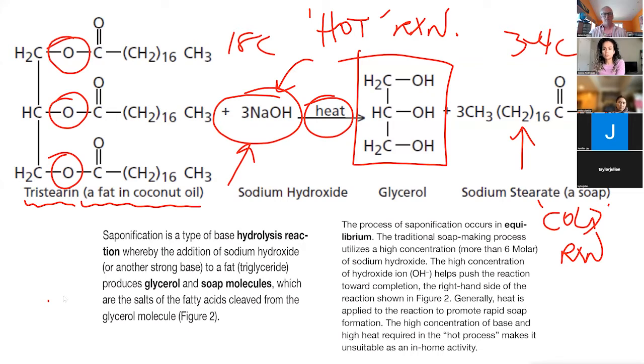There's a higher reaction rate. Almost always, especially if it's an endothermic reaction. And this is an endothermic reaction. The more heat you put in, the faster it goes. And like the reaction we did last week, we noticed that when we increased the temperature, the catalase reaction went faster. And that's typical for most. So one reason is the temperature is lower.